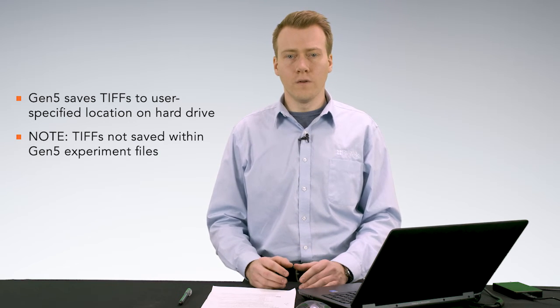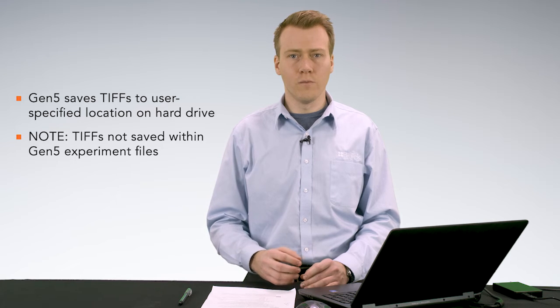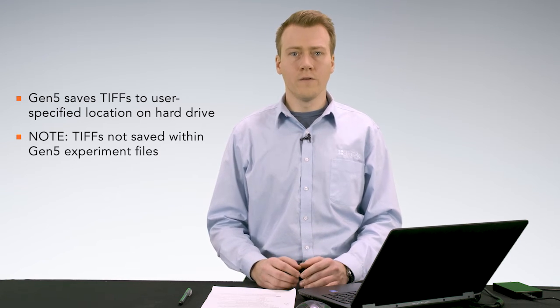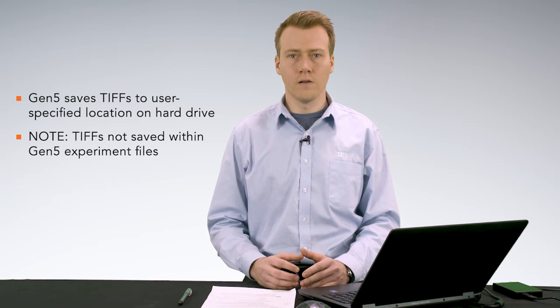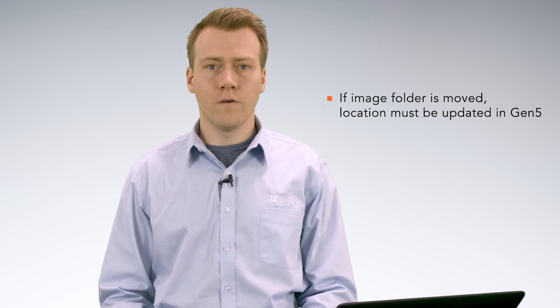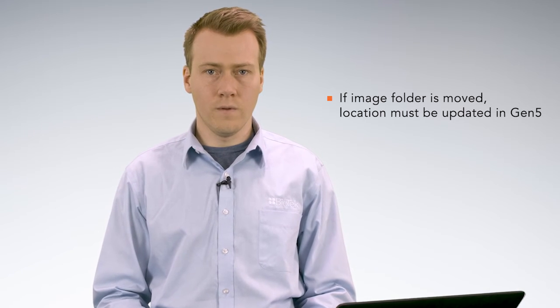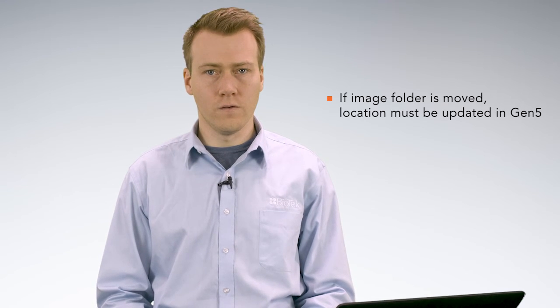It's important to note that the images themselves are not saved within Gen5 experiment or manual mode files. Rather, the Gen5 software looks for where the images are located on the hard drive. Therefore, if you were to move your folder to another location on the hard drive or to an external drive, you'd have to go into the Gen5 software and specify where that folder was moved to.